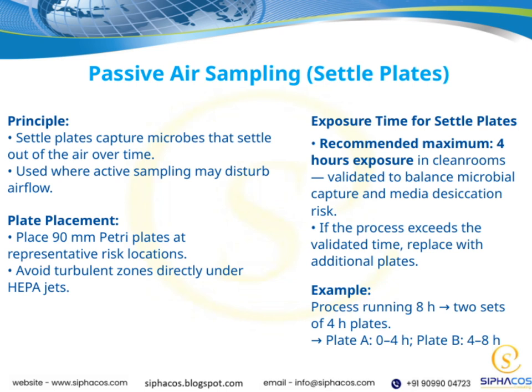The first set, Plate A, would cover the 0 to 4 hour period, and the second set, Plate B, would cover the 4 to 8 hour period. This way, we can monitor microbial presence over time without compromising the media.